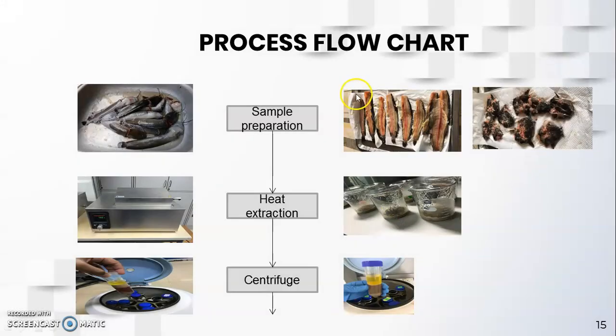Methodology. For methodology, first, sample preparation was conducted, such as cutting and blending the catfish. Then the sample was placed into the water bath for the heat extraction process. After certain minutes, the sample was left to cool for 15 minutes or 30 minutes.